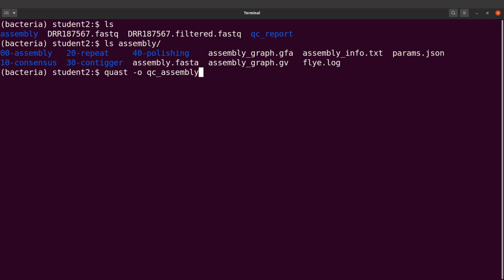The output directory here will contain the output files. I'm also going to indicate the number of threads. I'll say --threads 4. Now the threads, you can use more than 4 if your PC supports it. So take note.